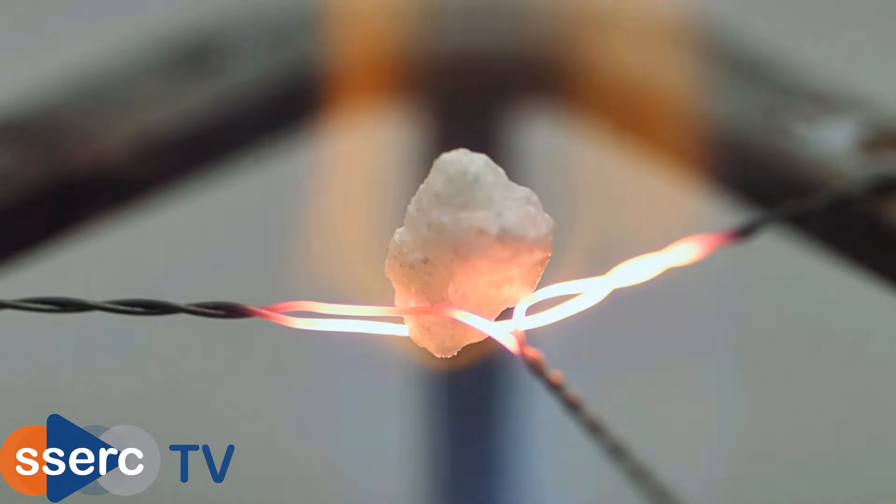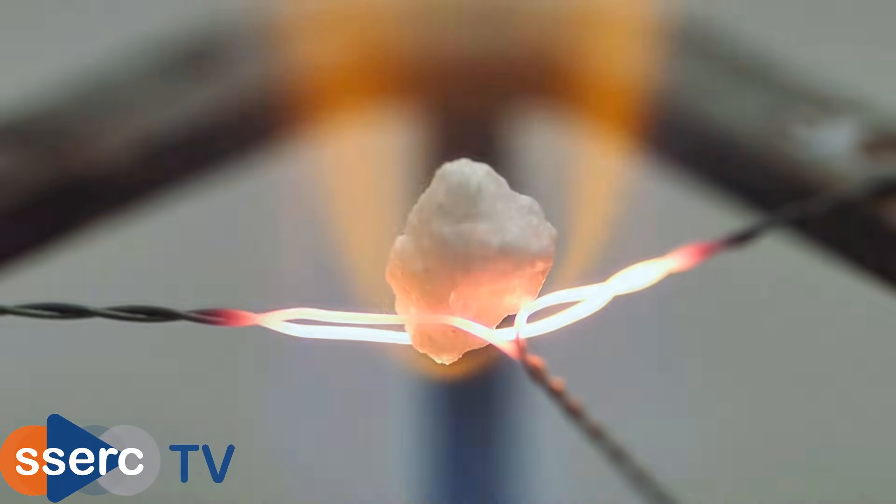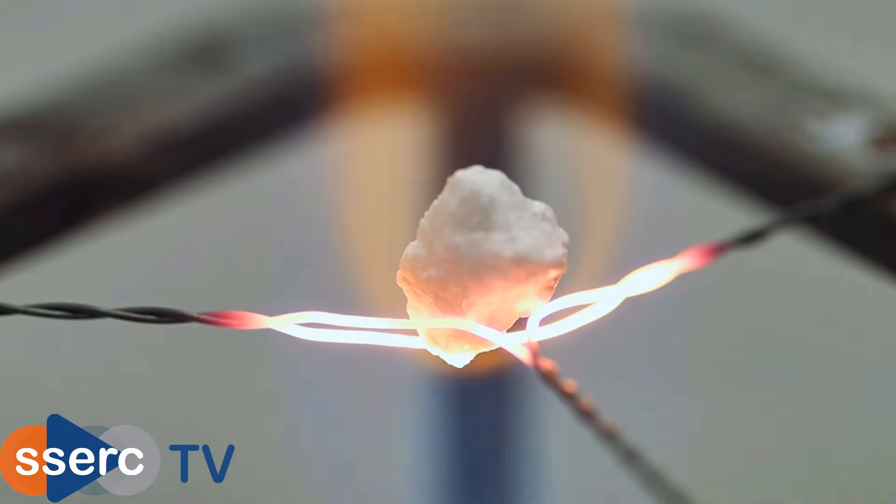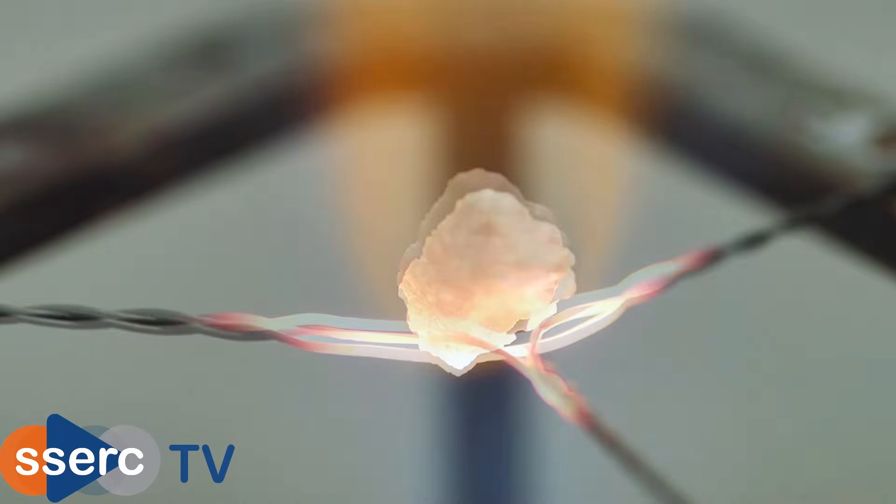You can see the metal holder glows very quickly, but it takes a while to notice anything significant happening to the marble chip. Eventually however you see it begin to glow quite brightly, especially at the bottom where the heat is most intense.